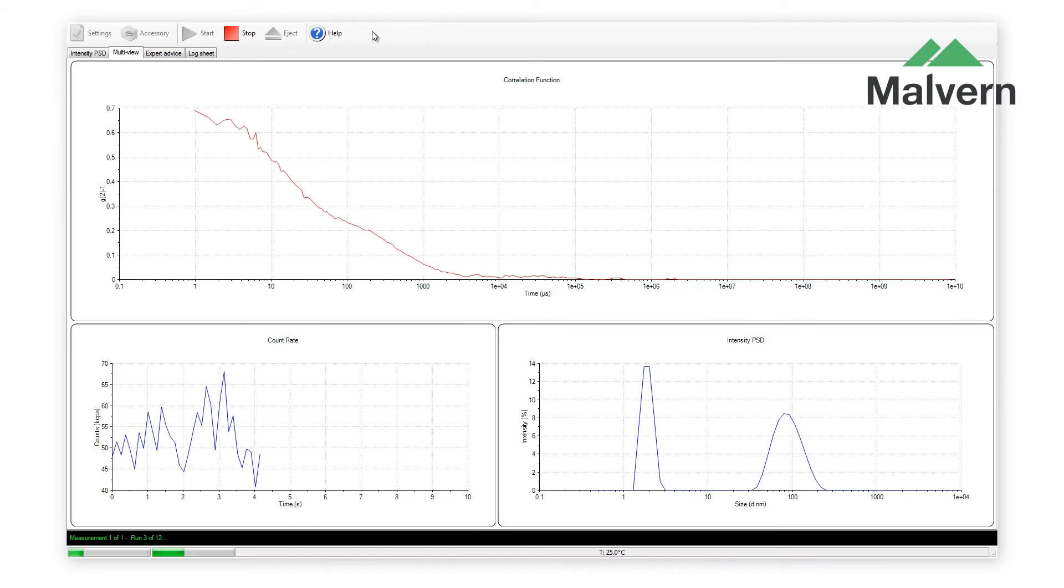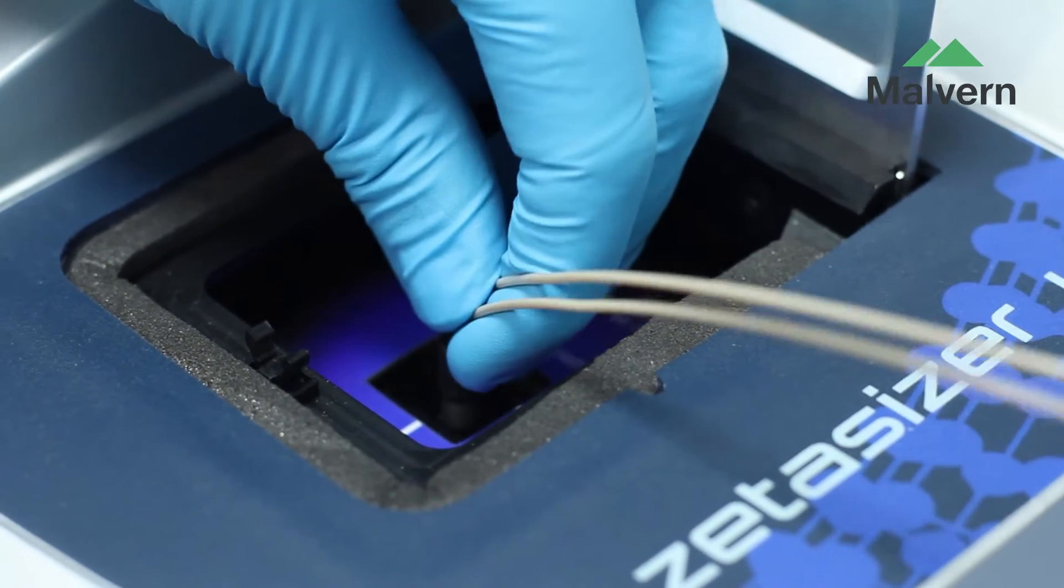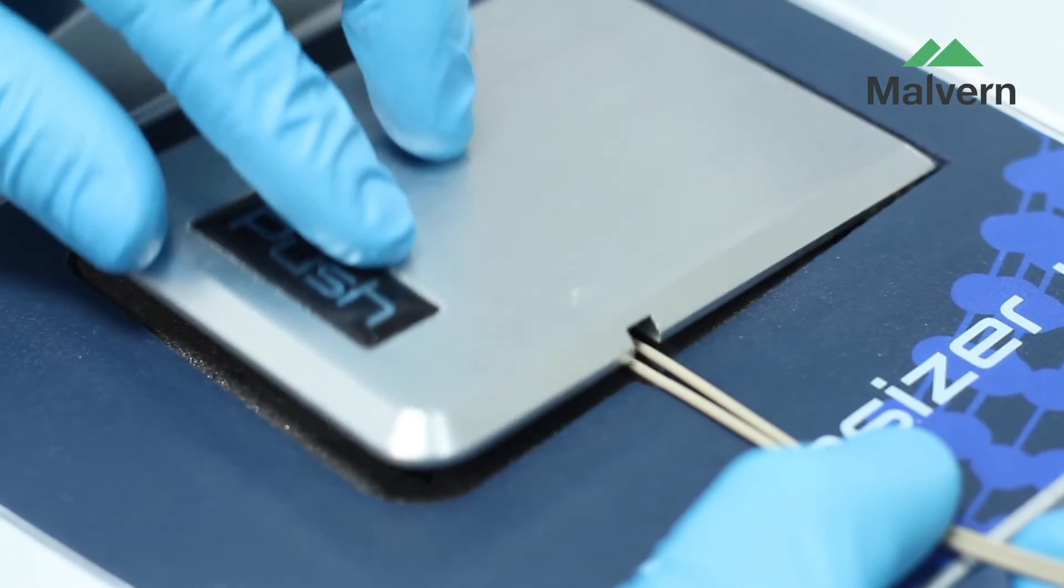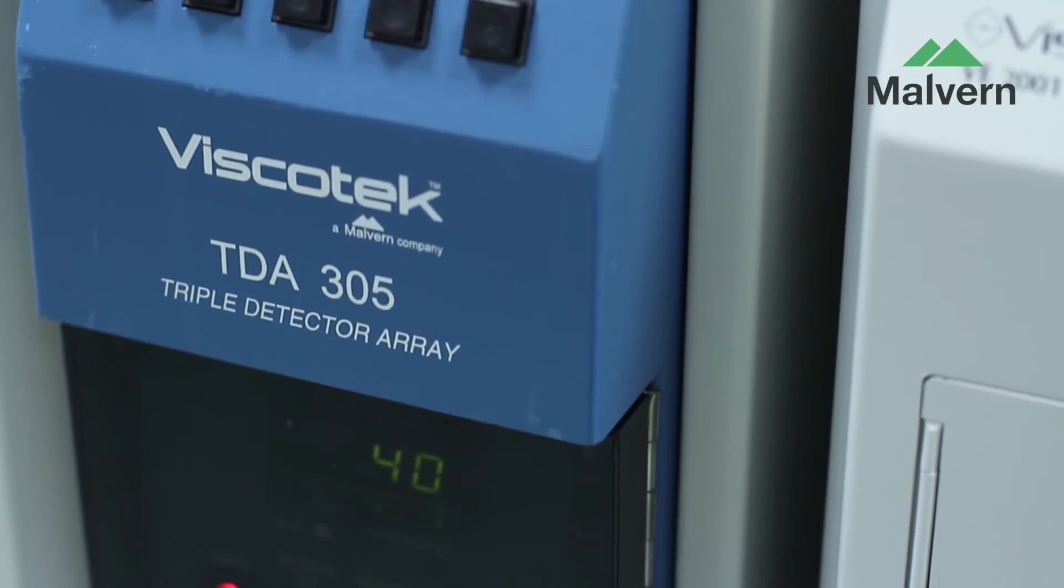The built-in protein calculators maximize the information that is extracted from the data. When attached to your SEC system, the Zetasizer Micro V is a sophisticated and powerful light-scattering detector, generating high-quality light-scattering chromatograms.